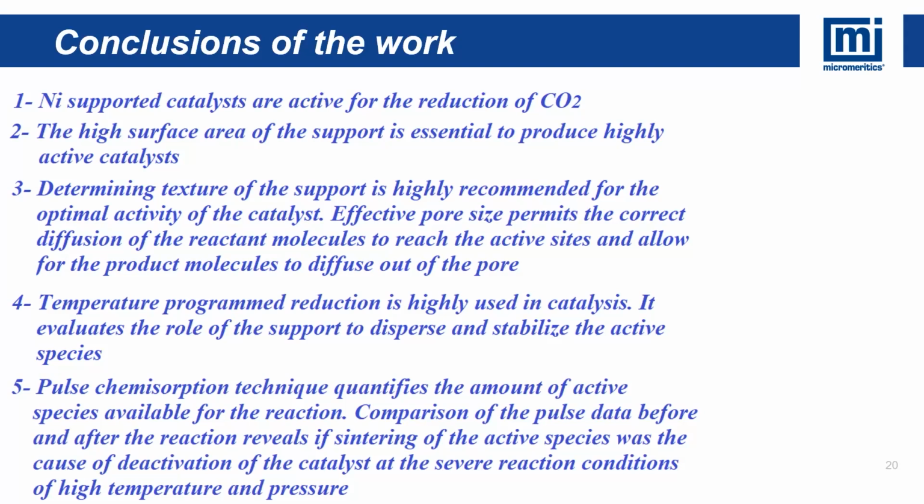It evaluates the role of the support to disperse and stabilize the active species, but it can also quantify the amount of oxide in your sample, because temperature programmed reduction can reduce all the oxide in your sample. In this case, we have nickel oxide. We can reduce the nickel oxide on the surface as well as the one in the bulk. So we can calculate the total amount of nickel oxide we have on the catalyst.